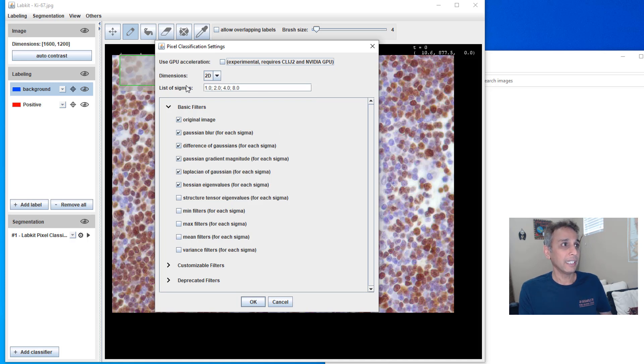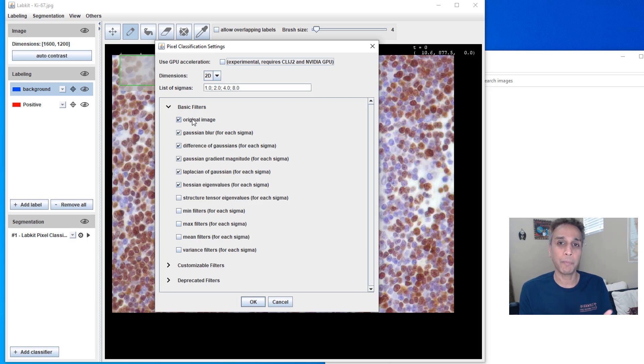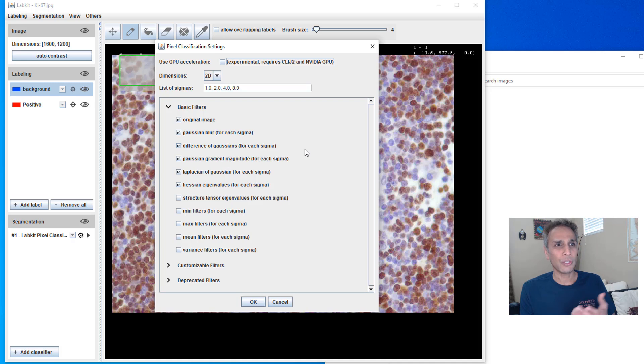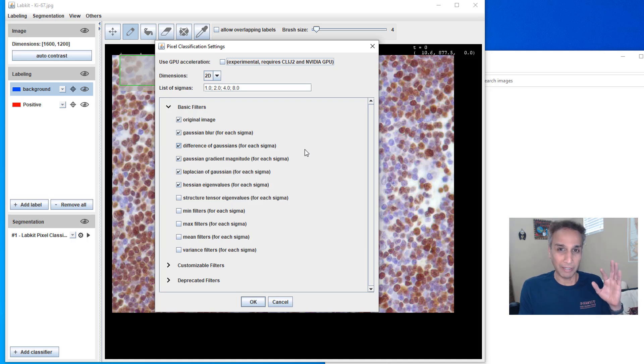And go ahead and read the documentation if you want to accelerate your segmentation using GPU. And I am going to, I mean, this is traditional machine learning. If you watched my previous videos, if you are a regular viewer, my videos in the numbers 80s, I believe, like 84, 85, one of those videos, I talked about using traditional machine learning for image segmentation.